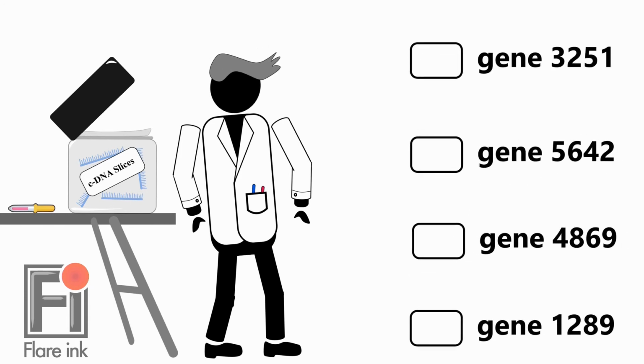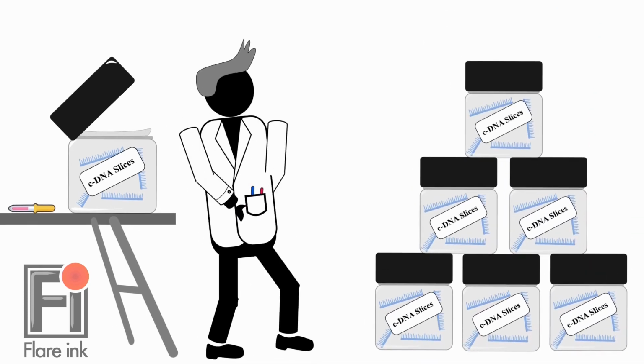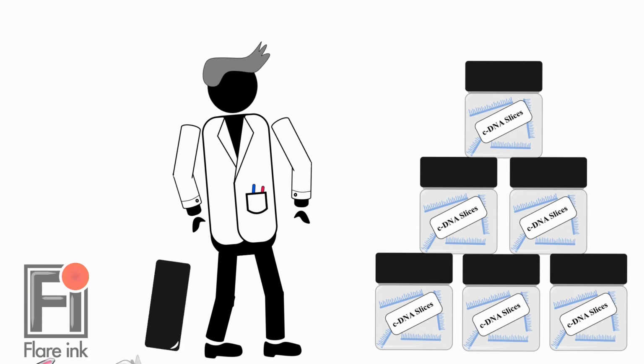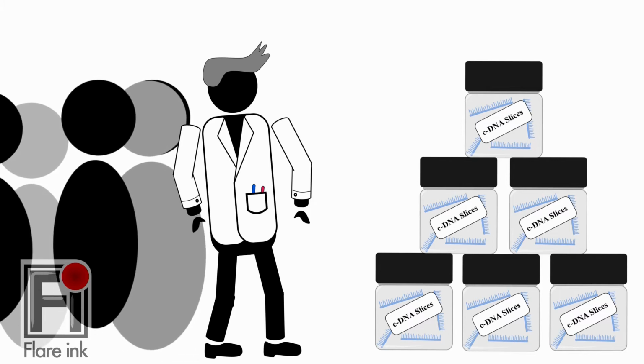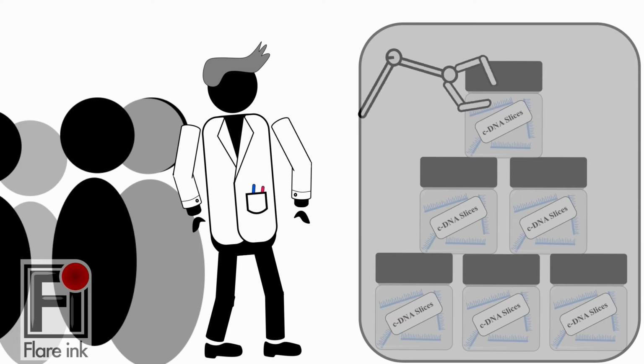This leaves us with a large number of cDNA strands whose expressions we have to identify in our sample. So how can we perform analysis on all these samples in an efficient way? We can hire a bunch of talented people to perform this task, or we can create a machine that automates this routine for all our cDNA strands.